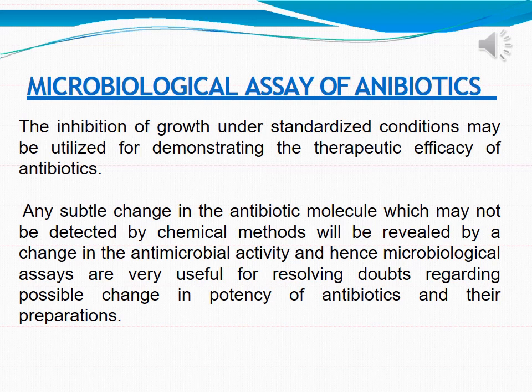Now what is microbiological assay of an antibiotic? Now we all know what is the function of an antibiotic. The function of an antibiotic is to kill the microorganisms. So that means that when you perform the assay on any antibiotic, the main criteria that you will be selecting to evaluate an antibiotic is how efficiently that particular antibiotic is able to kill that particular strain of microorganism.